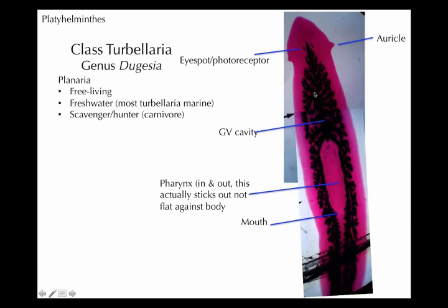This is a stained picture — they're not really pink — and you can't really see their gastrovascular cavity that much. I just took two pictures and put them together; it's actually even longer than this. What you can see is a number of features. They are not parasitic, so they're what we call free-living. The Turbellarians, or at least the Planaria, they live in freshwater and are carnivores — scavengers or hunters.